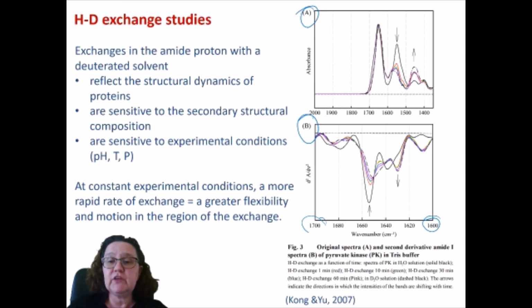And as you can see, the different colors reflect different times during the reaction, from 1 minute to 60 minutes, and the black line reflects performing the reaction in deuterated solution, and the arrows show how the bands increase or decrease as the time passes.